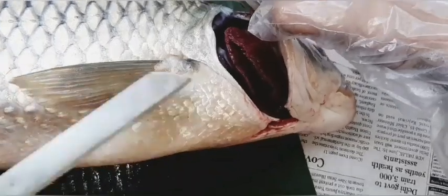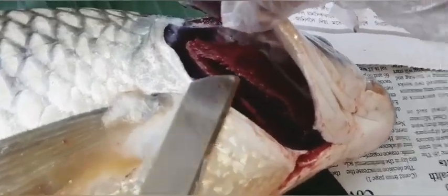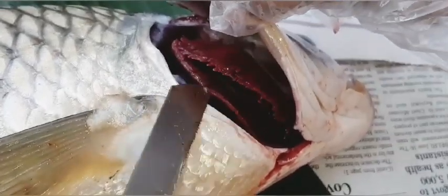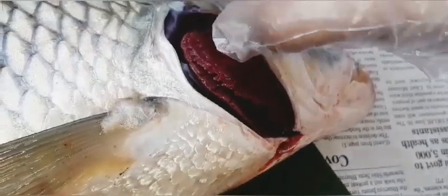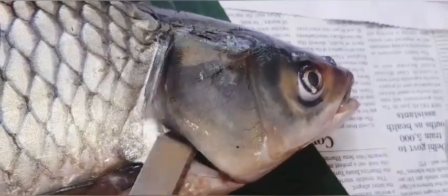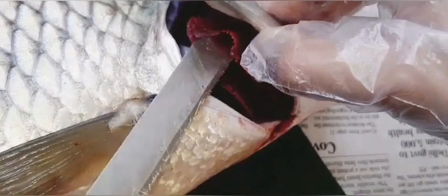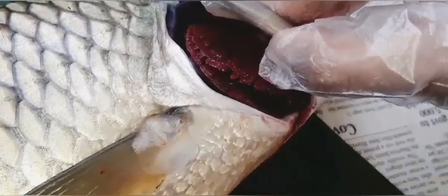These are the gills of the fish, and it has 4 pairs of gills. So on one side there are 4 gills. So this is 1 gill, 2, 3, 4, like this. 4 gills are there on one side. So there are 4 pairs, a total of 8 gills. These gills are red in color because they are enriched with blood, and these gills help in the respiration of the fishes.